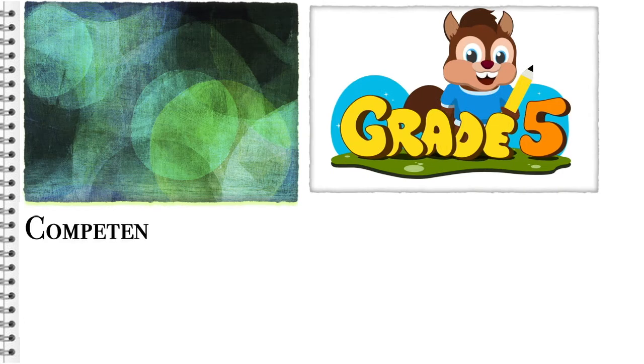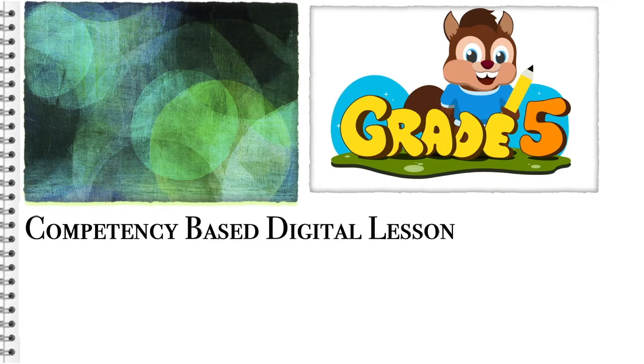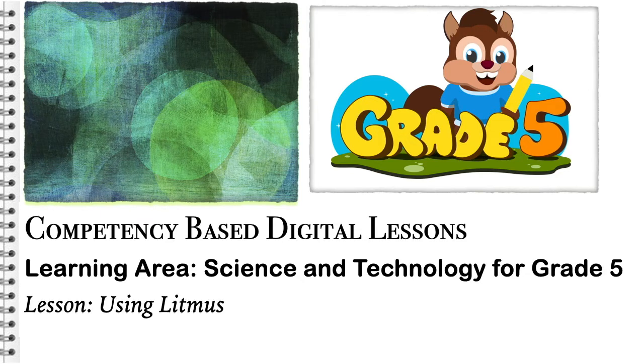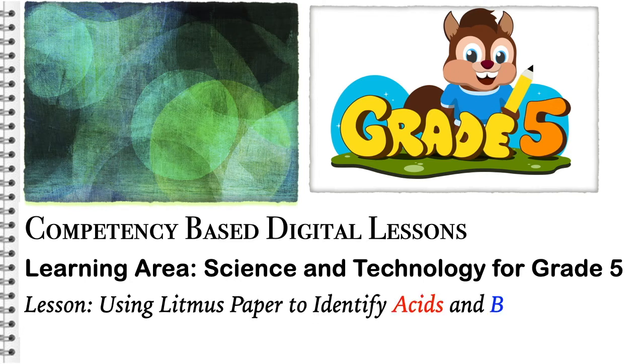Dear learner, welcome to our competency-based digital lessons. Our learning area in this video is Science and Technology for Grade 5. In this video, we will learn about acids and bases. In our lesson, we will use litmus paper to identify acids and bases.